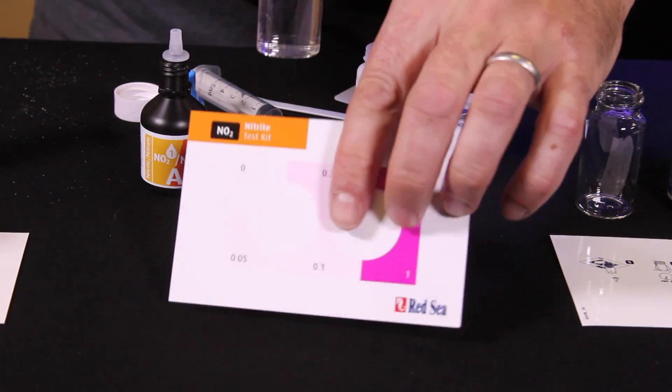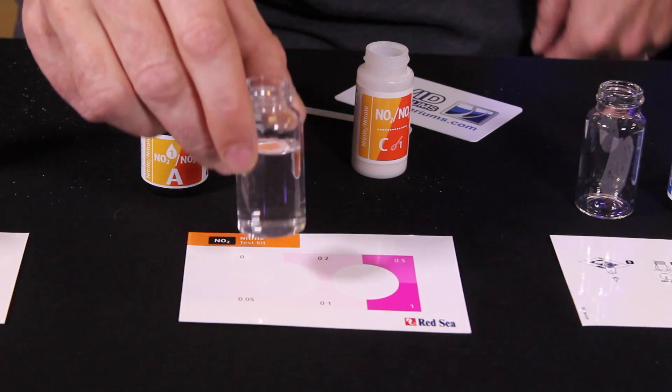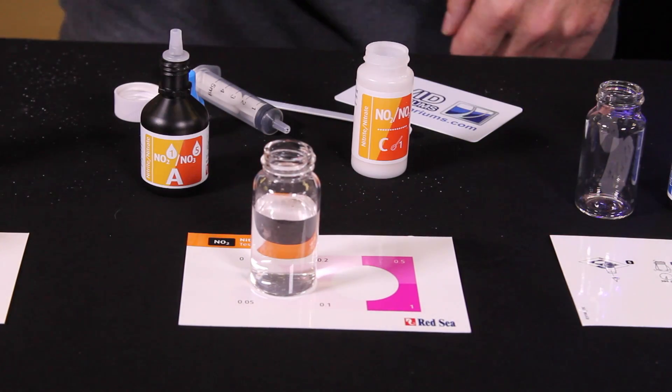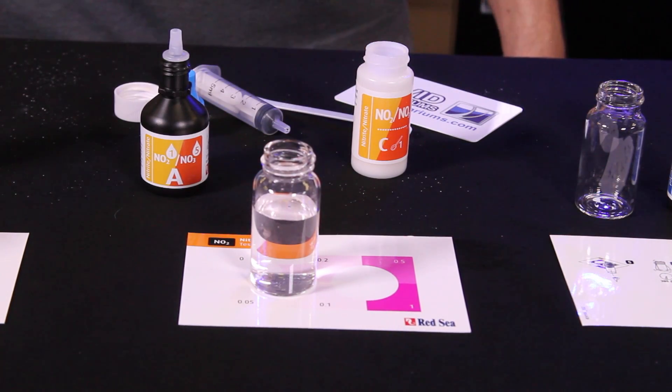And then we need to wait nine minutes for our nitrite test results. Now the reagent has dissolved. I'm going to flip the card over and set it on our color comparison chart. We'll come back and check our nitrite test results shortly.